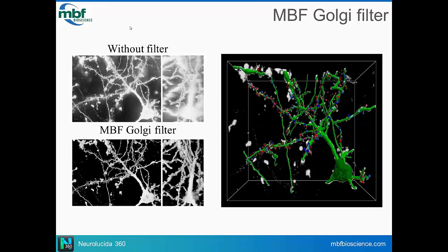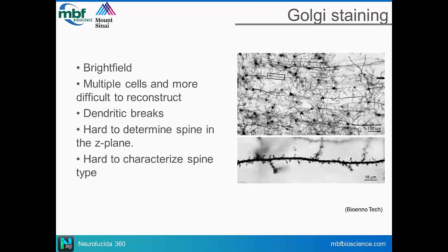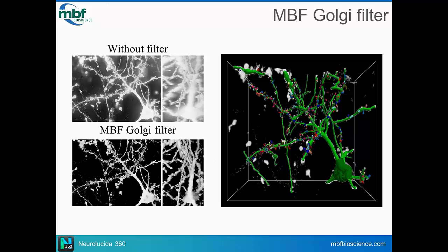So right now, you're familiar with Golgi, and if you invert the image, you can really see the impact of the precipitate that forms in the process of doing the Golgi, and just how branches above and below where you're looking can obscure the image data near it. So the dendrites and spines that are next to it.